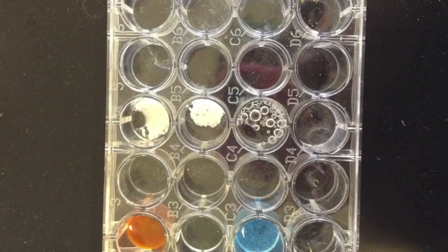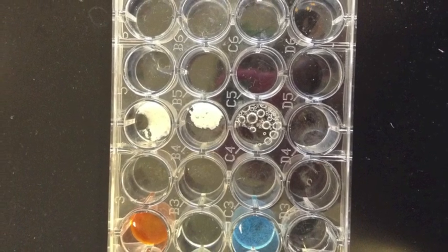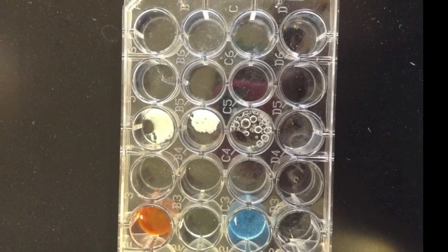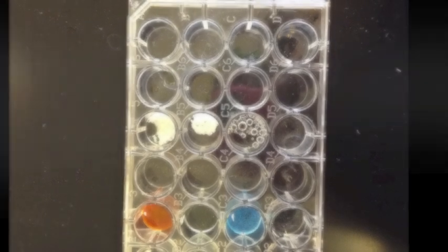It did not react with solutions 5 and 7, formed white precipitates with solutions 2 and 3, and created bubbles with solution 4, which we determined to be hydrochloric acid.